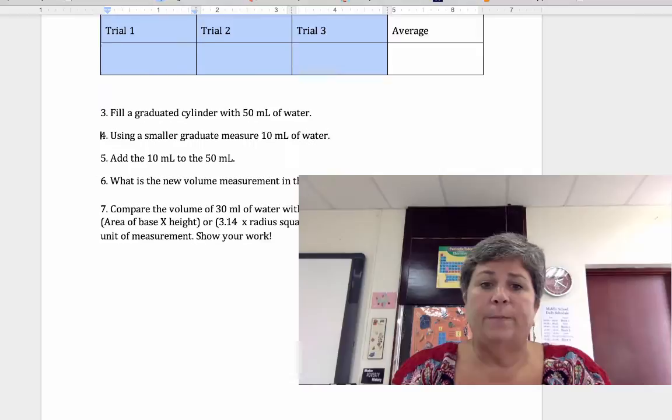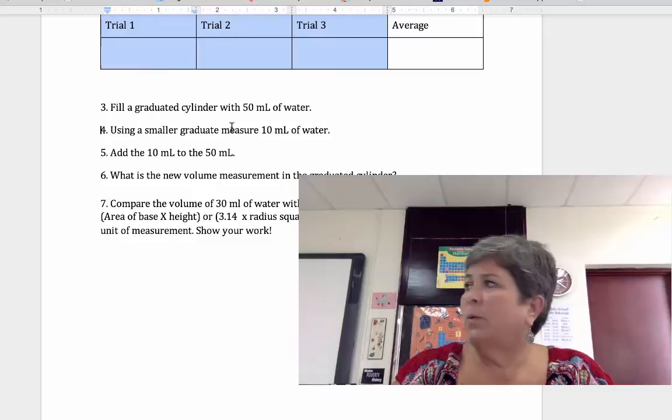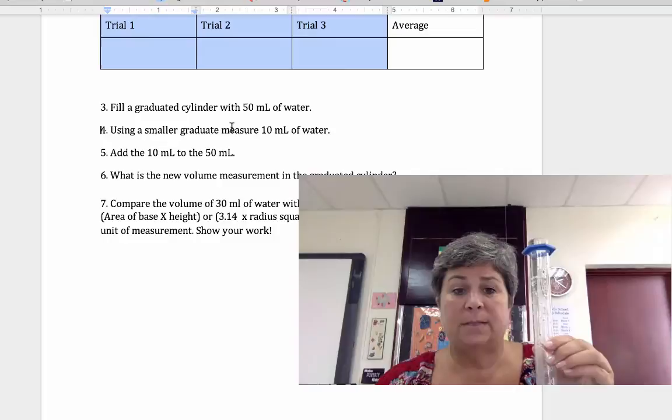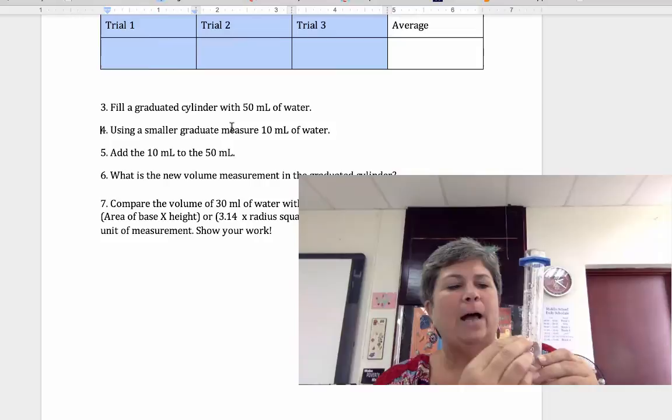Next, fill a graduated cylinder with 50 milliliters of water. Using a smaller graduated cylinder, measure out 10 milliliters and add that to the 50 milliliters — so you'll need to use the 100 milliliter graduated cylinder, because the 50 milliliter one can't measure beyond 50. Add the 10 milliliters you measured in the small one to the 50 and record the new volume measurement. We're trying to see how accurate our graduated cylinders are.